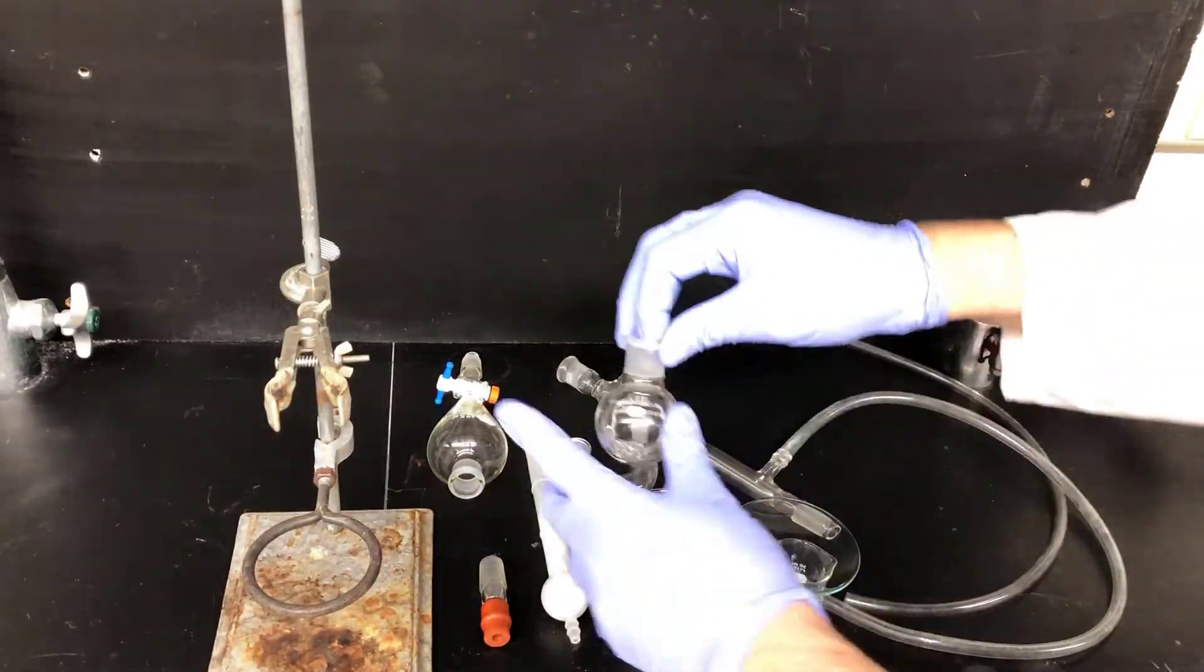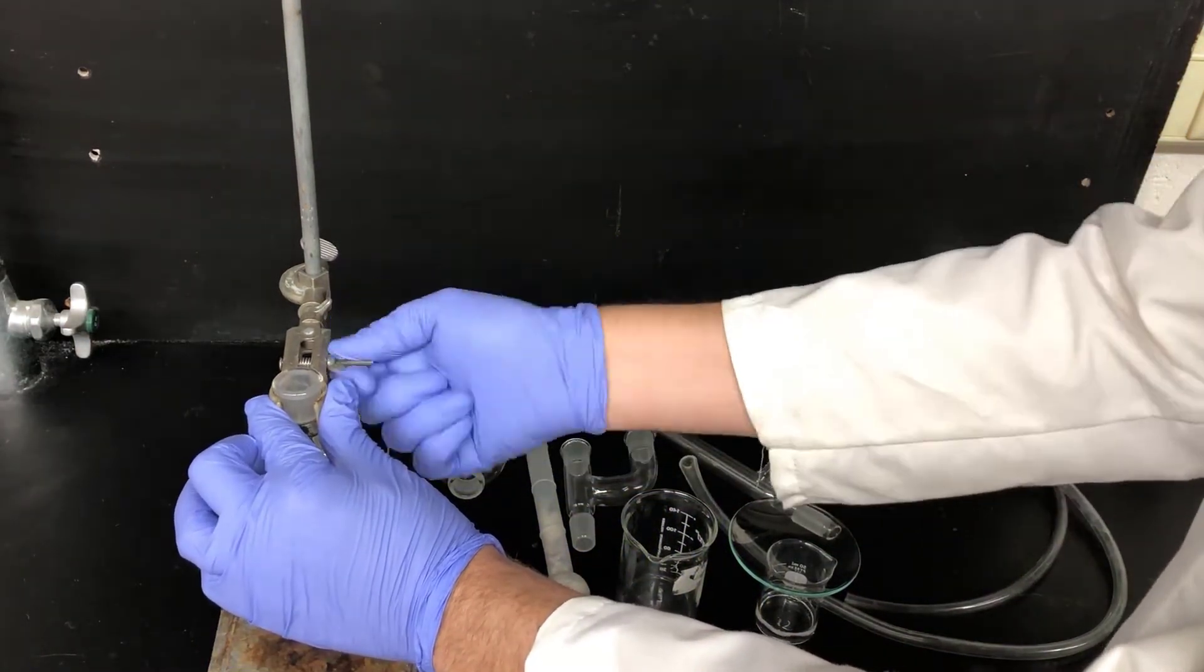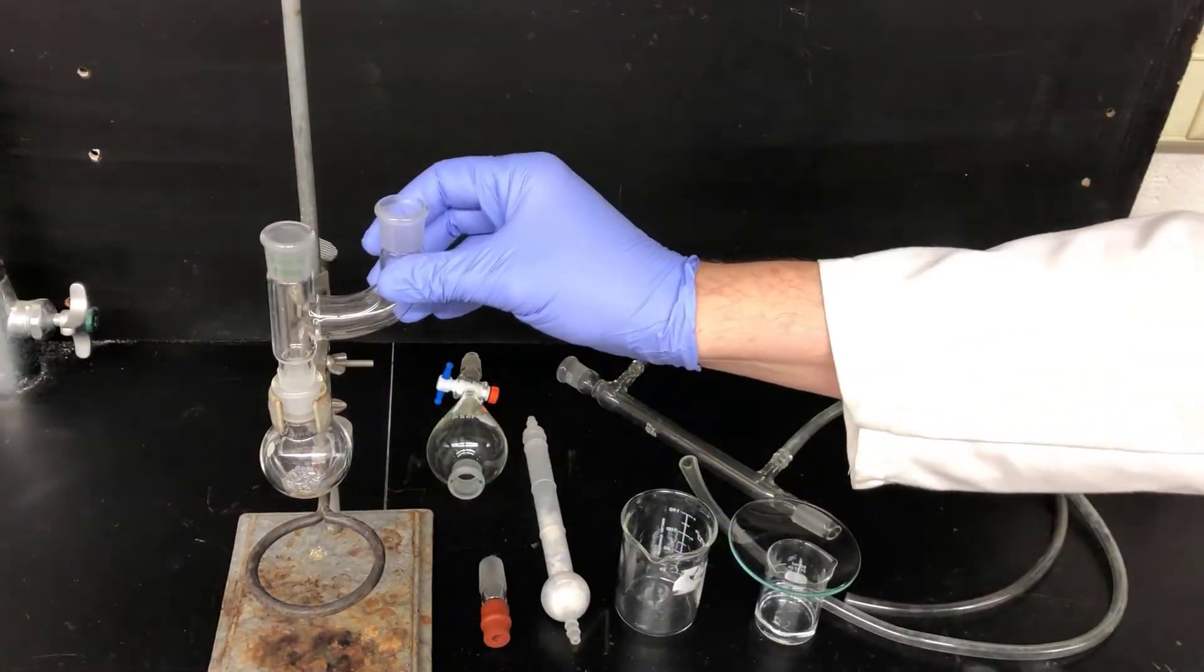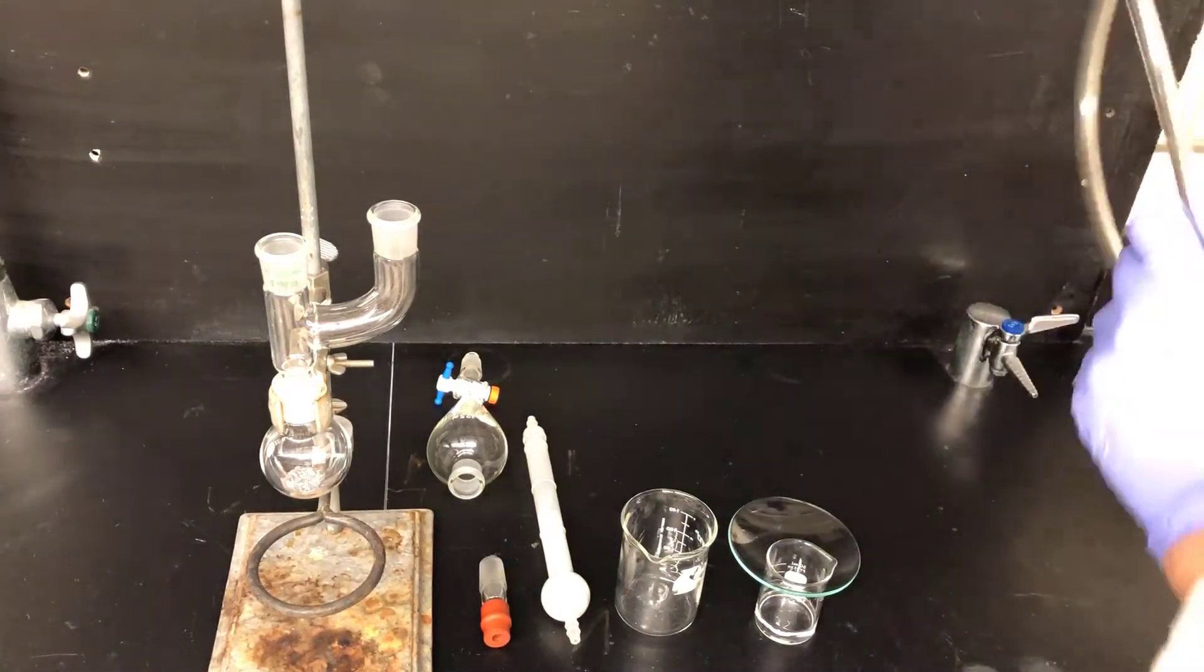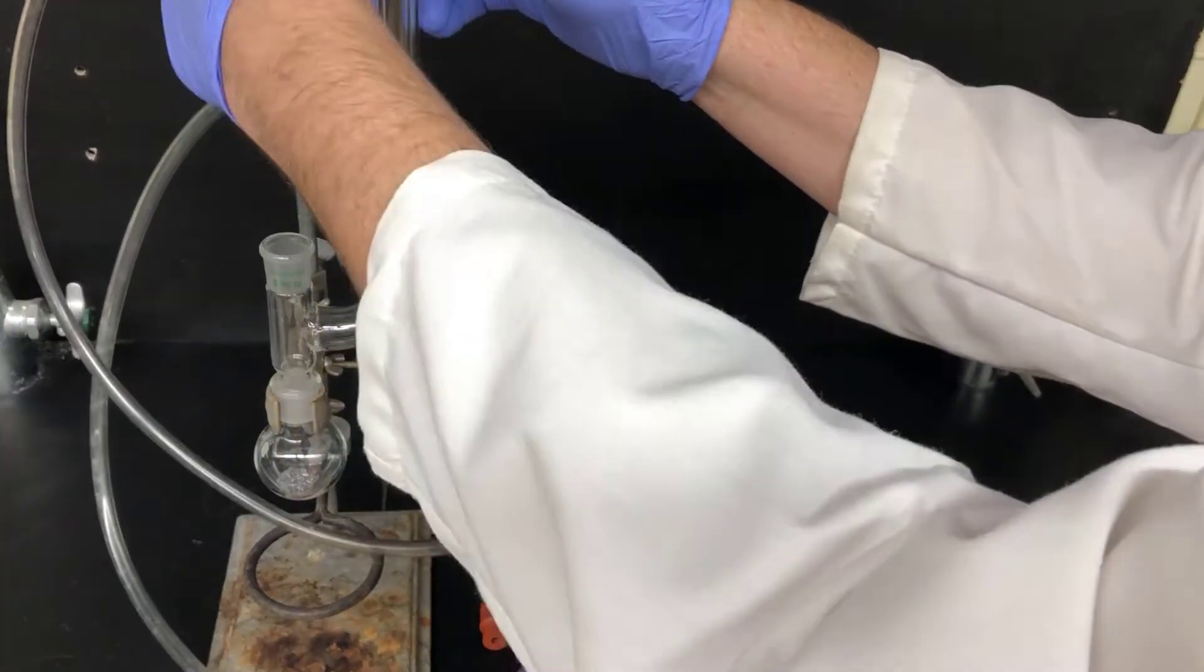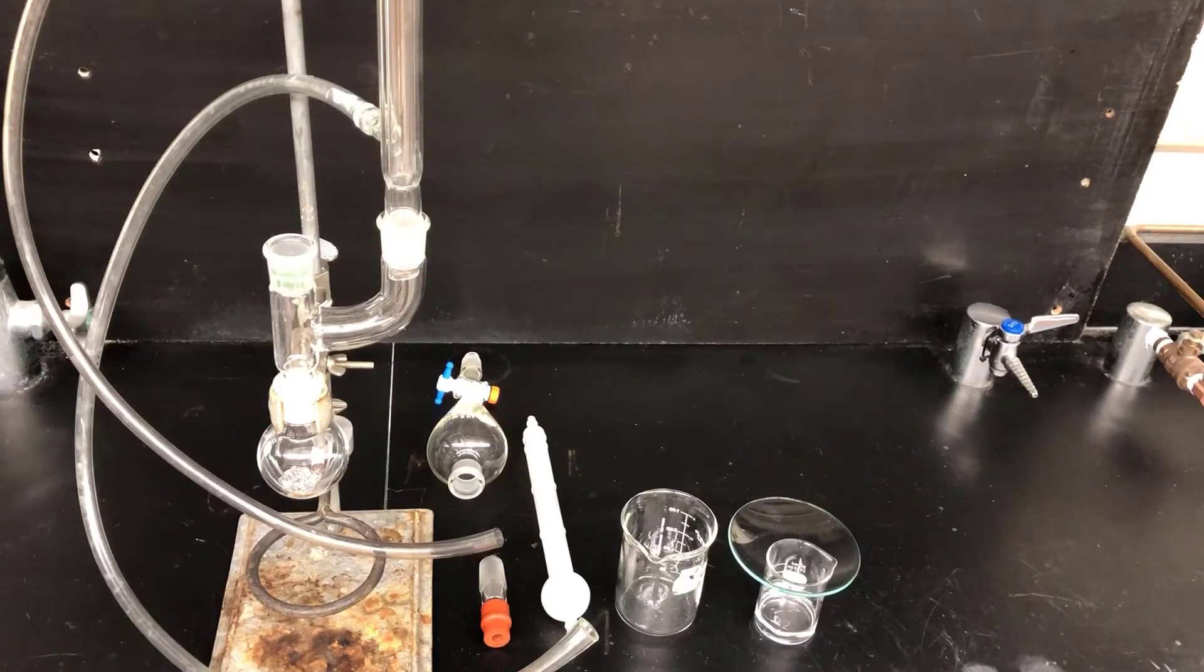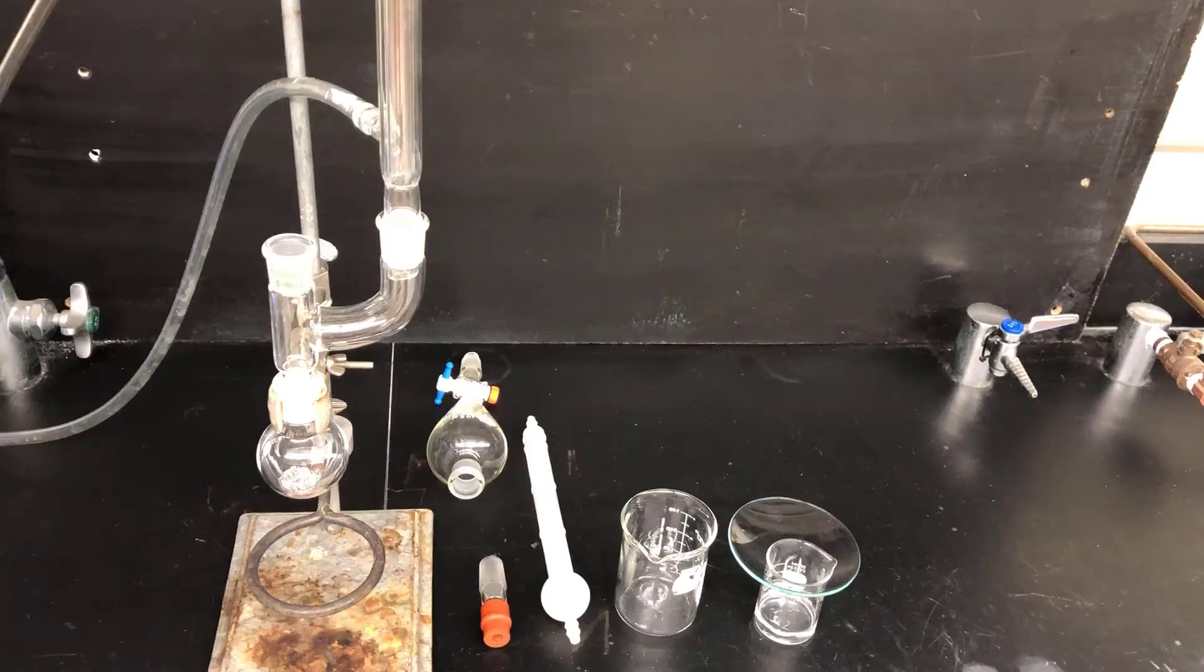Now it's time to assemble the reaction apparatus. I'll start by clamping the flask with the magnesium to a ring stand. Then I'll take a U-shaped adapter, this is often called a Claisen adapter, and I'll put that into the flask. This will adapt the flask to allow us to plug in two things. One of the things I'll plug in is a condenser, and I'll stick that into the hole that's offset. Then I'll clamp the condenser to the ring stand to stabilize the apparatus. The bottom hose of the condenser is the water inlet, that goes to the faucet. And the top hose of the condenser is the water outlet, that goes to the drain.